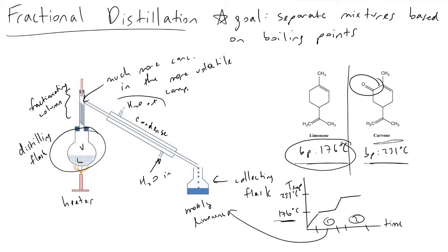And in addition to that, one of the things that you'll commonly find in distillation setups is a vacuum. And it's not always necessary, but the vacuum will help vaporize your liquid within the distilling flask. And if we ask ourselves why, intuitively it should make sense.